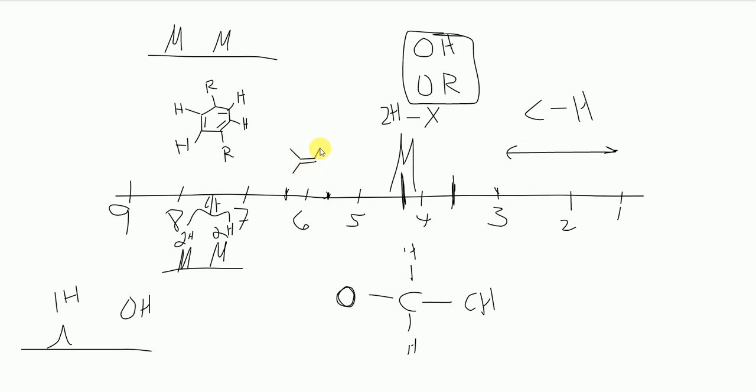Okay? And these can be represented weirdly because of the way the multiplicity values work. And usually it's represented by multiple peaks. So you'll have different ones. Okay, and it'll be easier to show through example rather than me trying to explain it. But yeah.